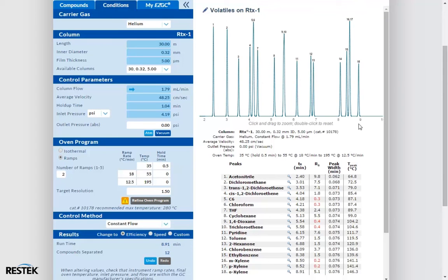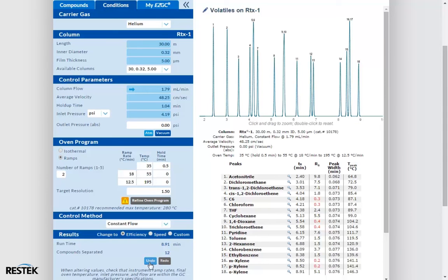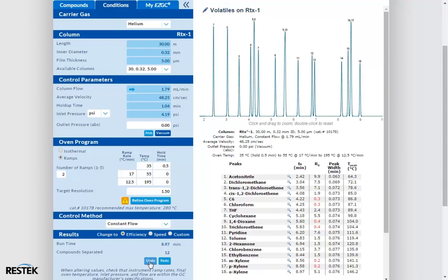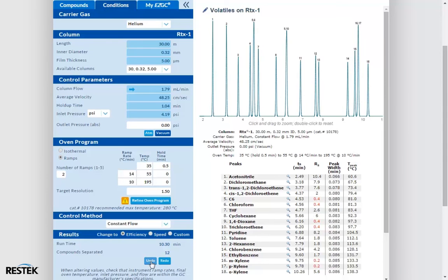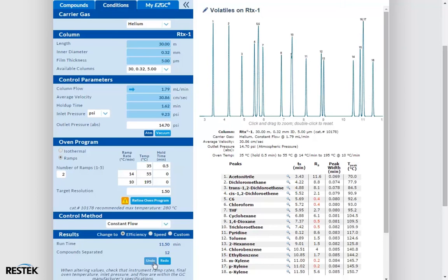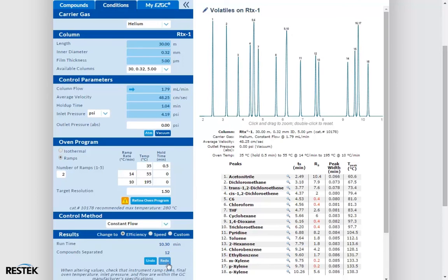We're down to just under a nine-minute run now, but I kind of liked having the improved resolution between peaks 12 and 13, so I'm going to go back to where we were by hitting Undo. Went a little too far. Redo. Okay.